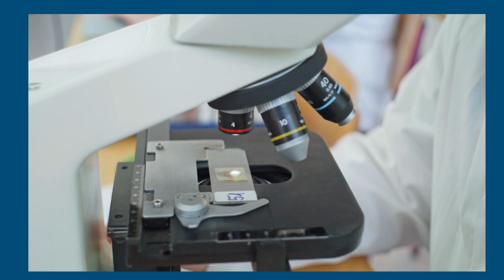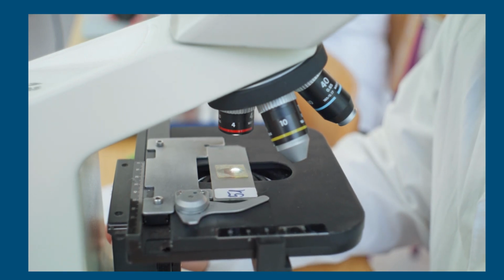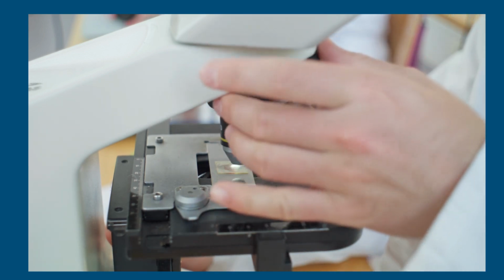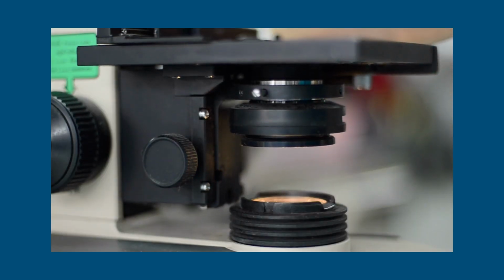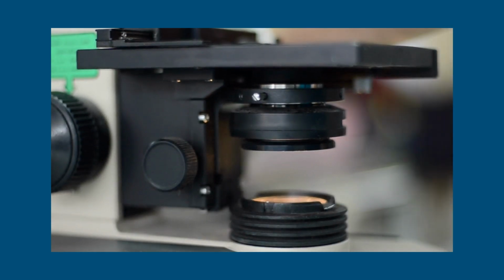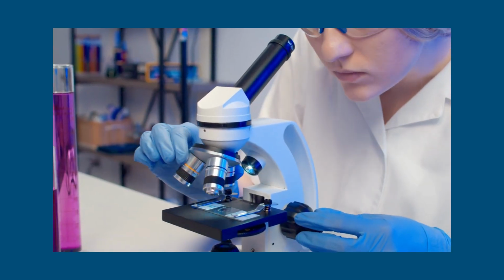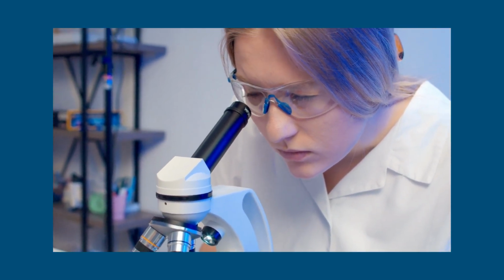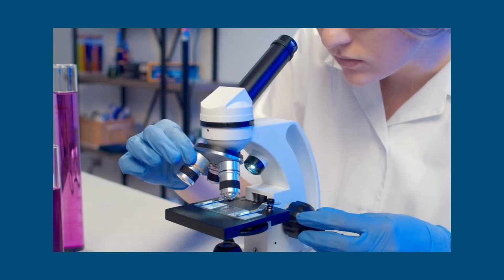The stage is where you place your slide. It usually has little clips to hold the slide in place, kind of like a phone holder for your specimen. Most microscopes have a built-in light or a mirror to shine light through your specimen. Without this, you'd be staring at, well, darkness. The eyepiece, also called the ocular lens, is what you look through. It usually magnifies by ×10, giving you a close-up view of your sample.